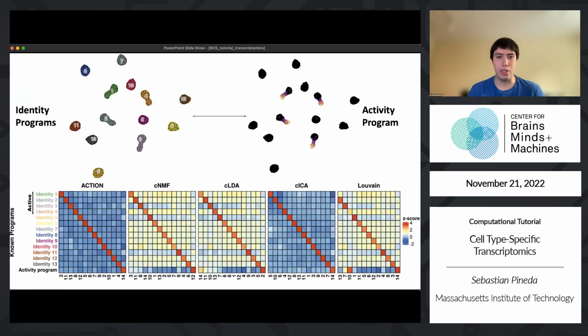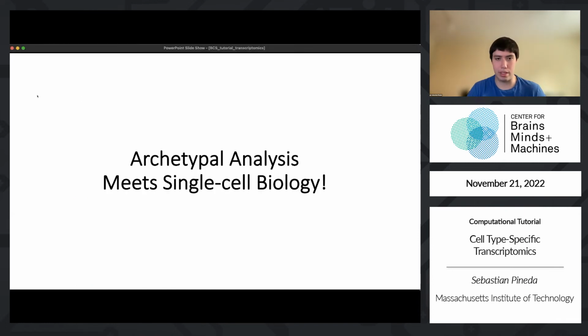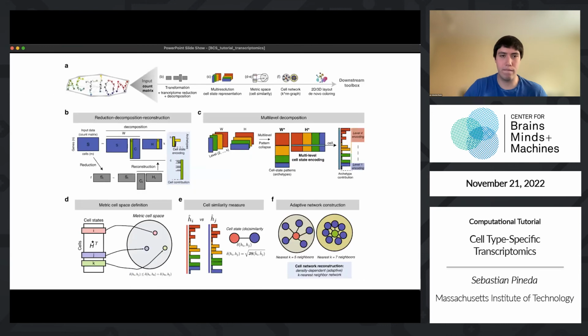And what we do is that, well, let's go back to the tutorial. This representation also is not only, actually, wait, no, let's not do that. Let's go here. Okay, we can use this representation and then also construct a network out of it, just like UMAP does with KNN, but instead of using the individual data points, we use these extreme data points. And then we can use that to assign membership of every other cell in the data set to these points.